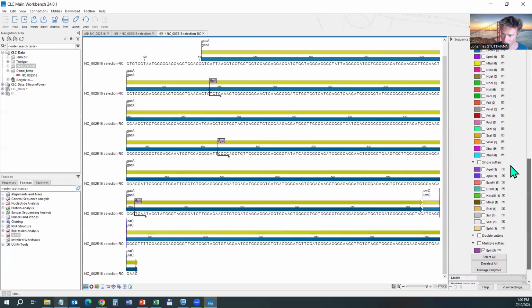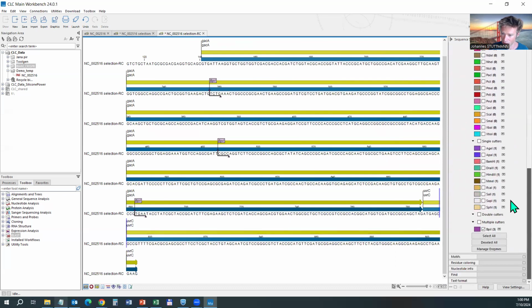So this is basically for this right-hand ribbon of sequence display options, okay? Then we have all the tools, and I think actually the nucleotide analysis is often very helpful. So reverse complementing, for example. And then what I use a lot are actually Sanger sequencing analysis, if I want to compare sequencing files with a reference, and also this cloning tab. I don't say that the rest is useless, but I mainly use the commands that are contained in these 3 different menus.